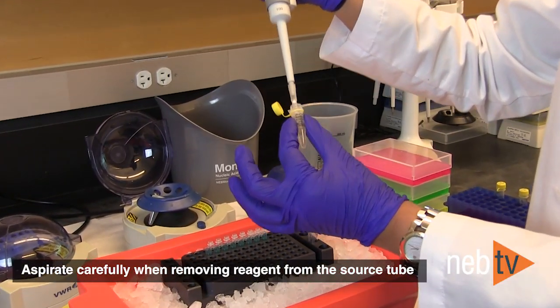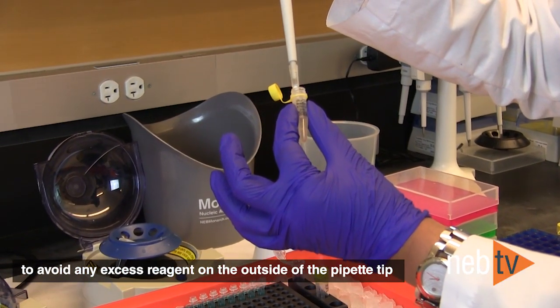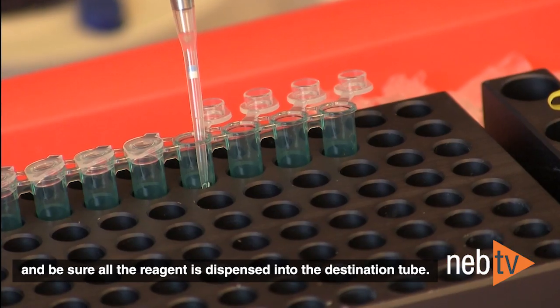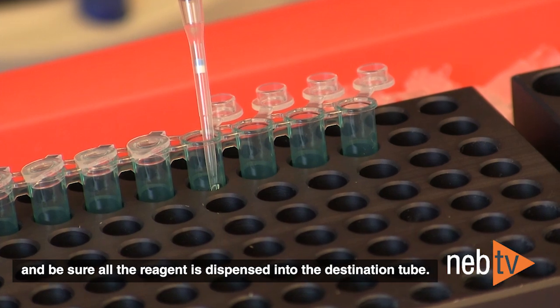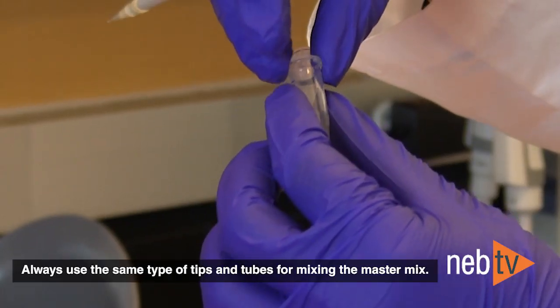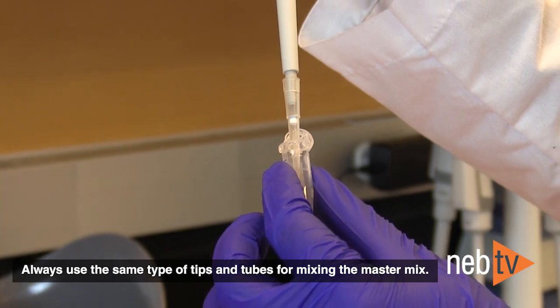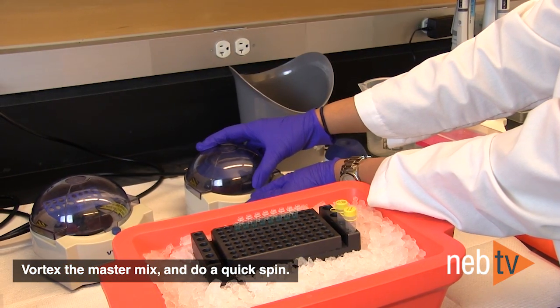Aspirate carefully when removing reagent from the source tube to avoid any excess reagent on the outside of the pipette tip, and be sure all the reagent is dispensed into the destination tube. Always use the same type of tips and tubes for mixing the master mix. Vortex the master mix and do a quick spin.